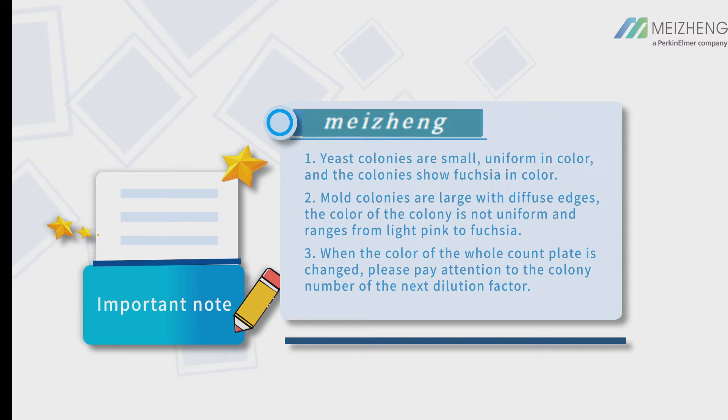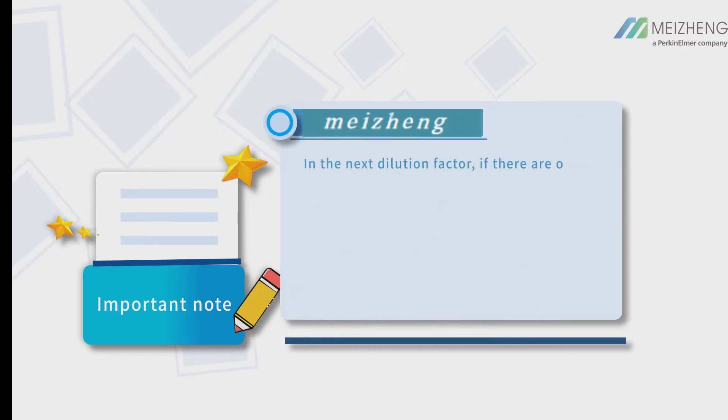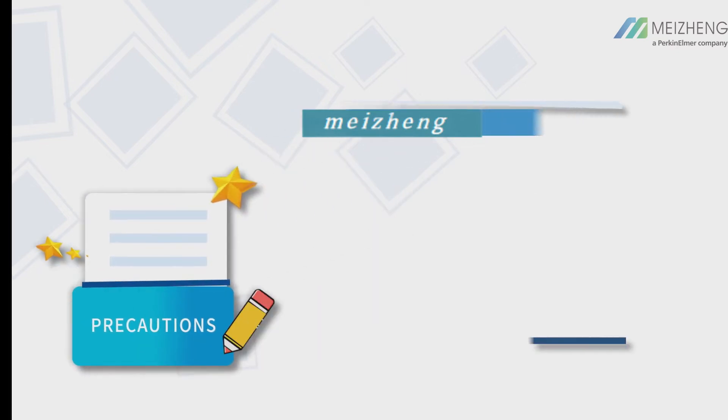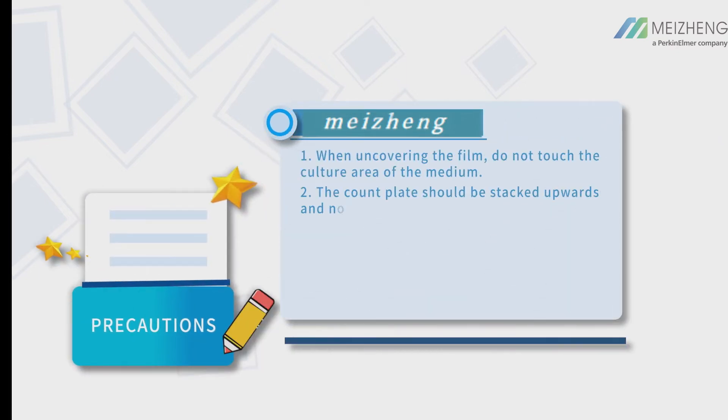When the color of the whole count plate has changed, pay attention to the colony number of the next dilution factor. If there are obvious colonies and the number is within the optimal counting range, count the colony number of that dilution. If no colony appears, the count plate has been polluted.